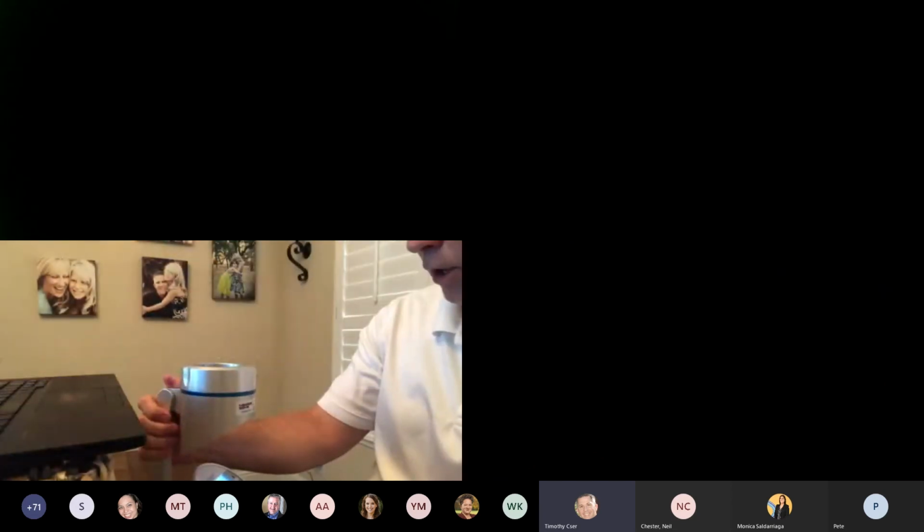That's pretty good. So I've got my manual adjustment 3, and I just hit select. And then that takes me to the next window that says adjust flow, and I'm going to pull that off. Now we're going to do a 3-point calibration. Adjust flow is 100 liters per minute. So now it's going to start my adjustment.